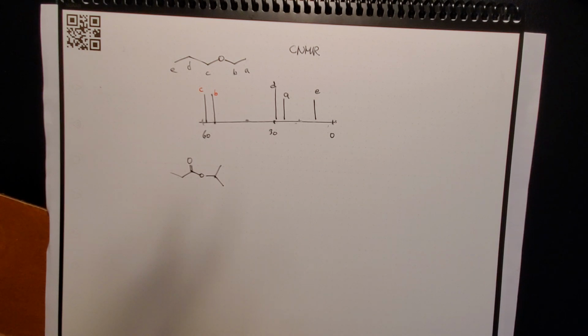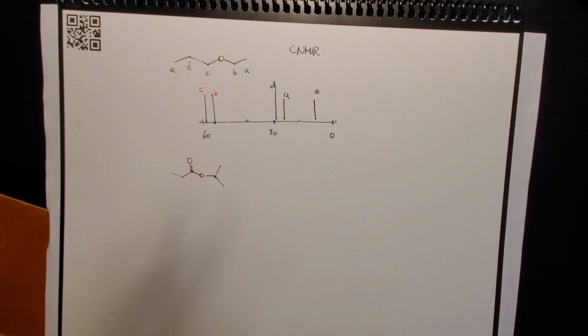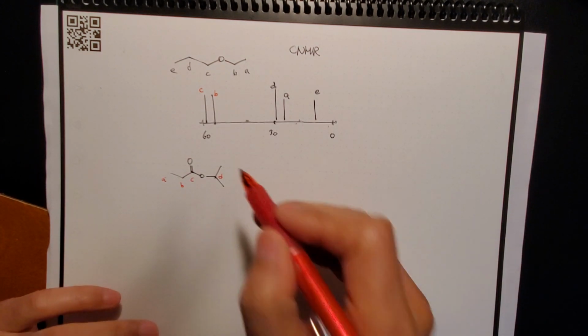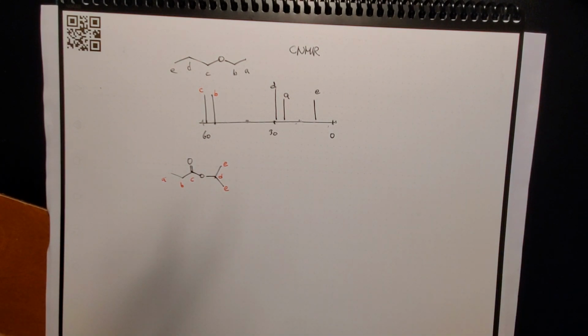If you apply the symmetry operation, you have 1, 2, 3, 4, 5, and there 6, right? So let's label them out. Here they're the same if you apply a mirror.